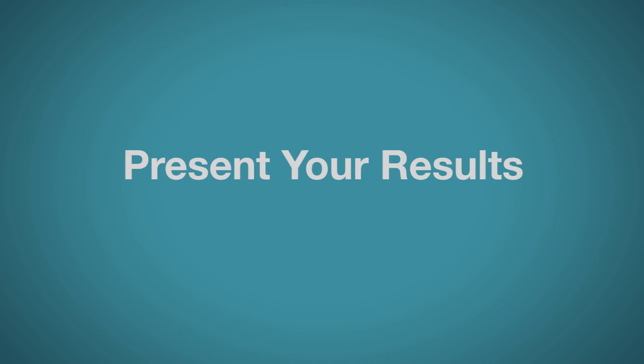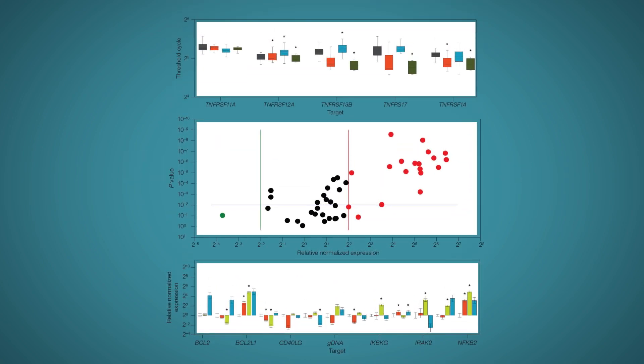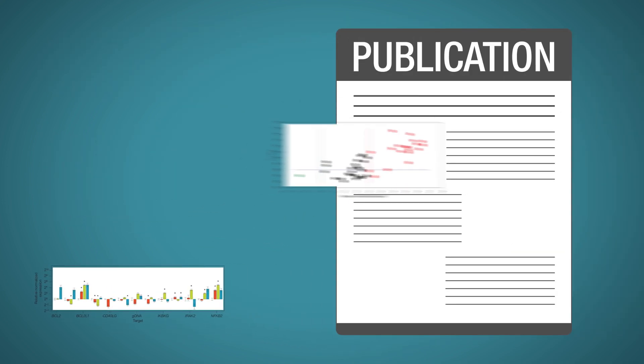You need to present your results. CFX Maestro features a simple way to graph your data and export high-resolution, publication-quality images.